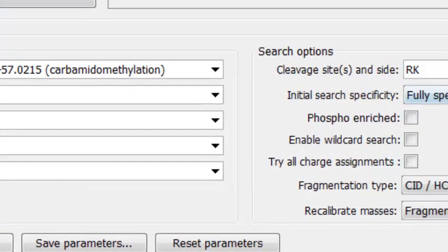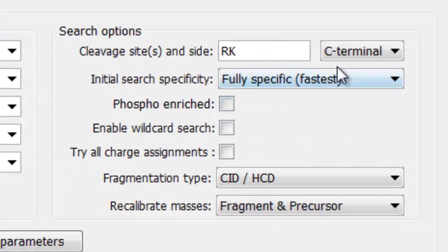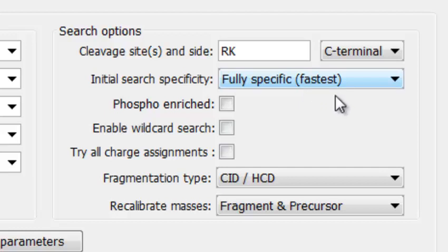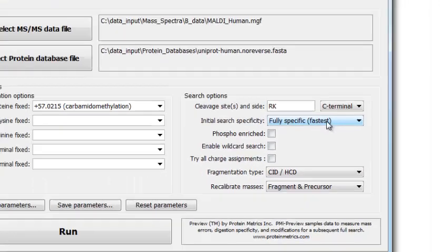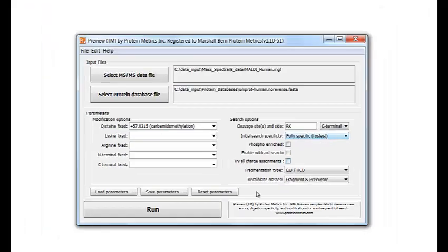Over here, you specify the digestion. By default, Preview assumes digestion with trypsin, but you can change the digestion to whatever you like. Here I'm leaving the default settings, and now I'll click Run to start the program.